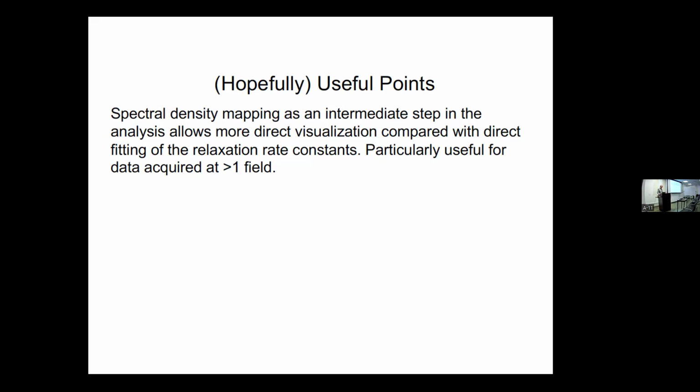But when it's looking at the quality of fitting, it's comparing predicted rates from the model to the measured rates.